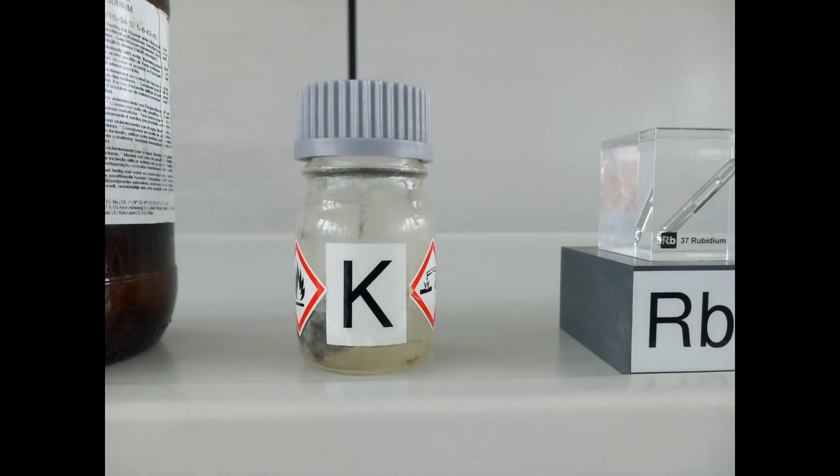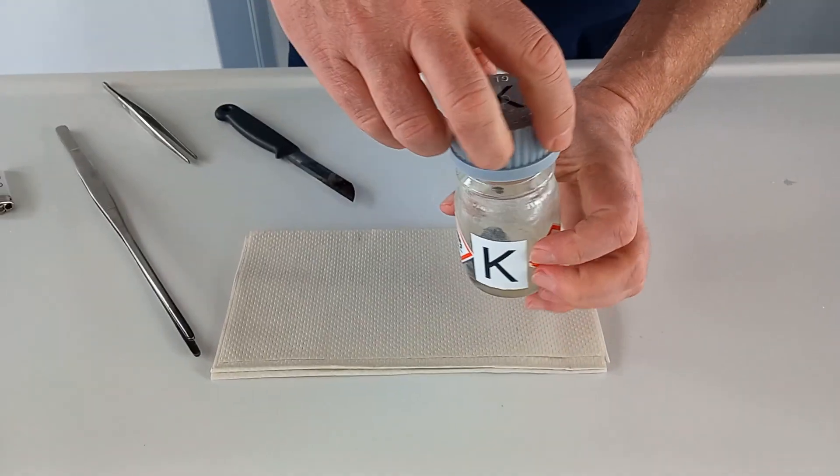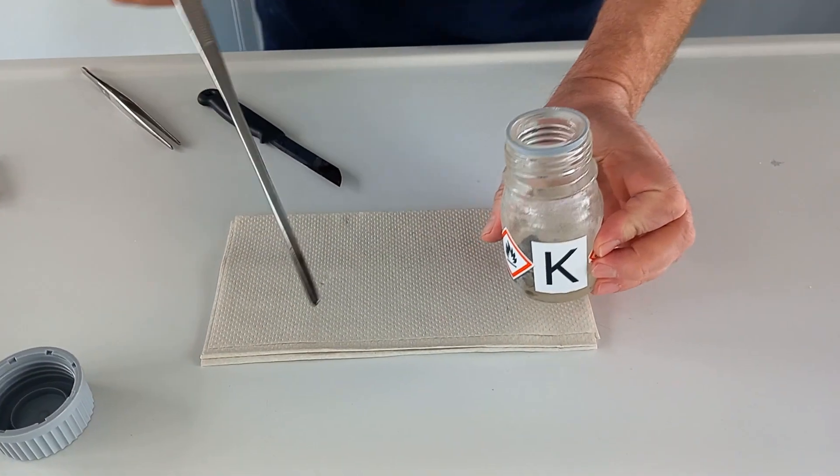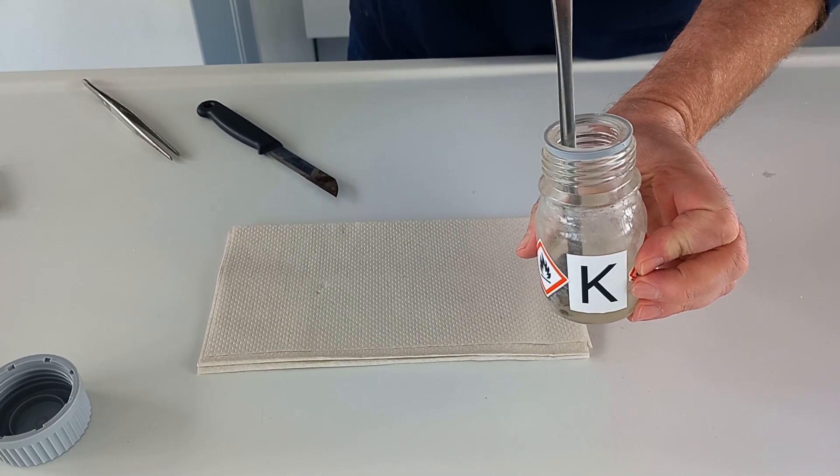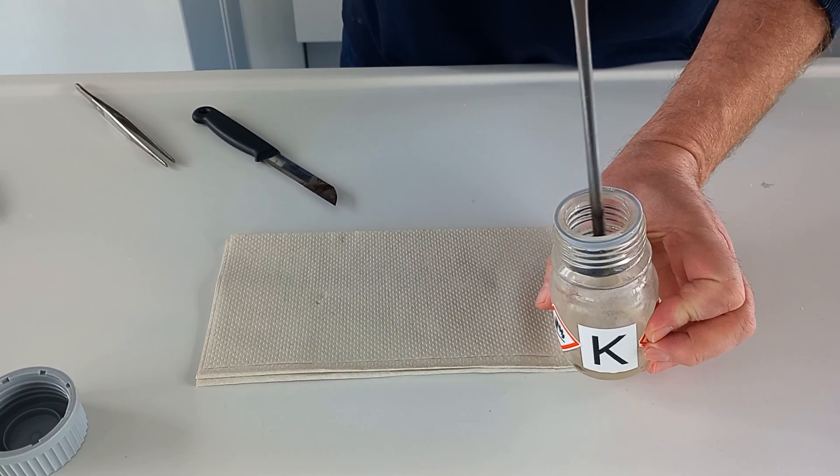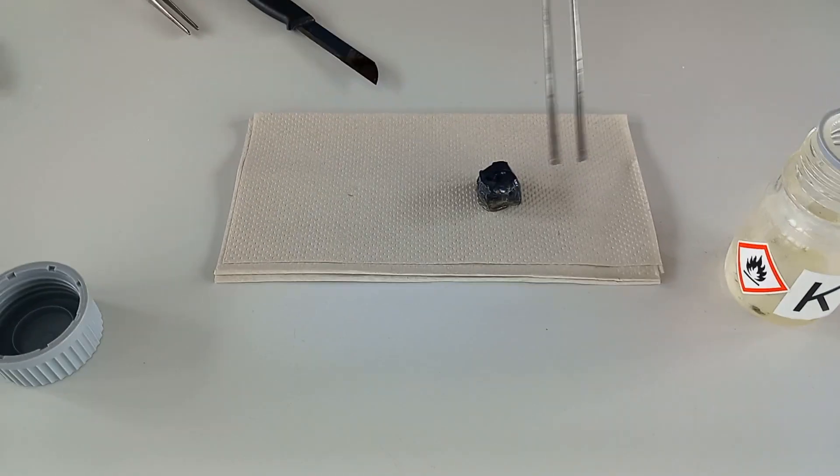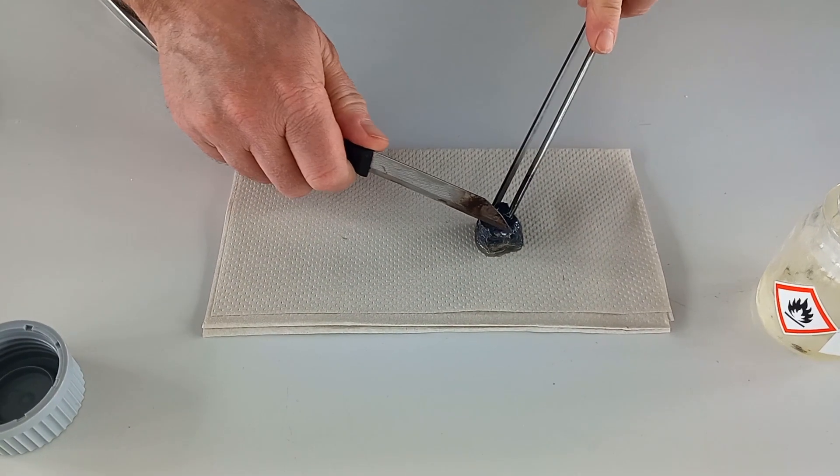The next alkali metal is potassium. Potassium is softer than the other two metals, so it can also be cut with the knife.